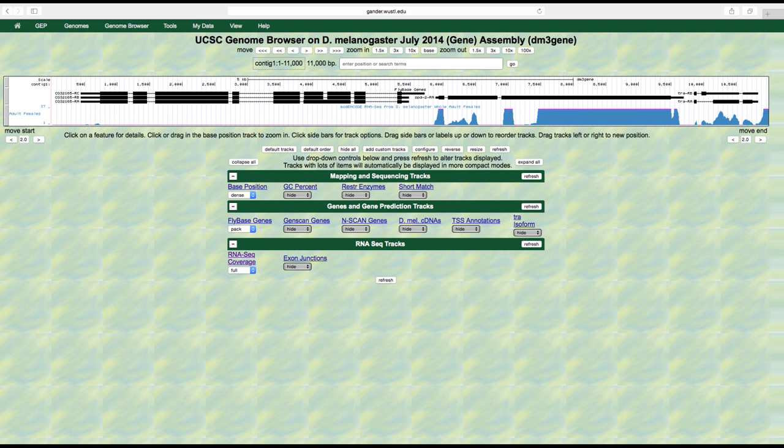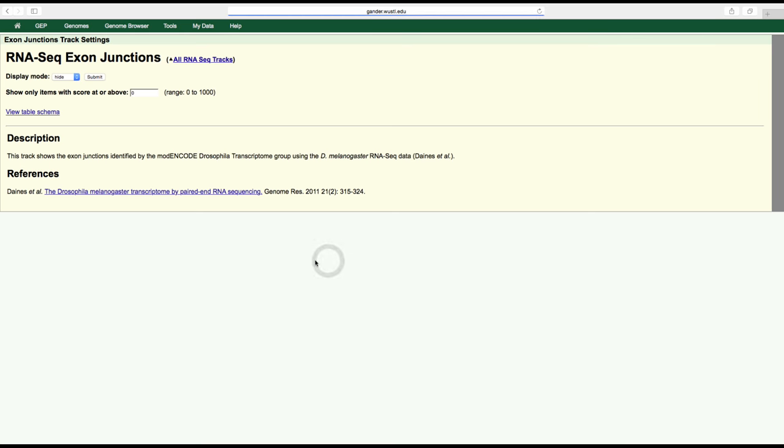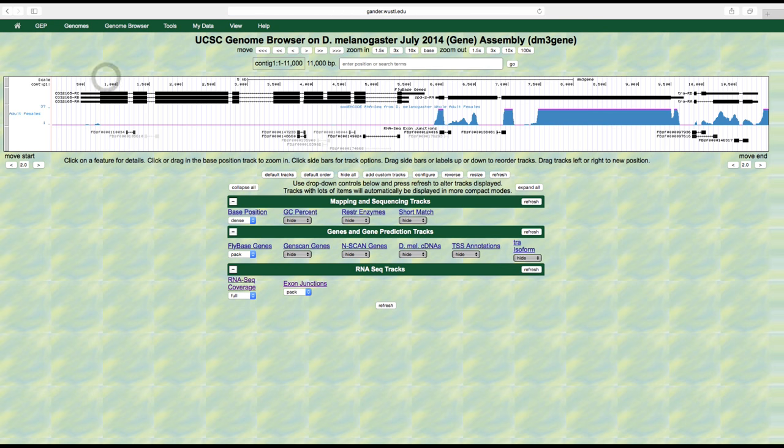In addition to RNA-seq coverage, it is often also helpful to consider splice junction prediction data that are derived from the subset of RNA-seq reads that span two or more exons, known as spliced RNA-seq reads. To visualize these predictions, click on the exon junctions link under the RNA-seq track section, use the drop-down menu to select pack, and then click submit. We can examine the splice junction predictions more carefully by zooming into the five prime and three prime end of the exon.